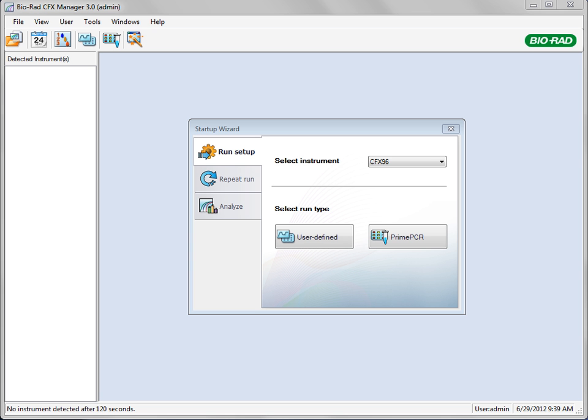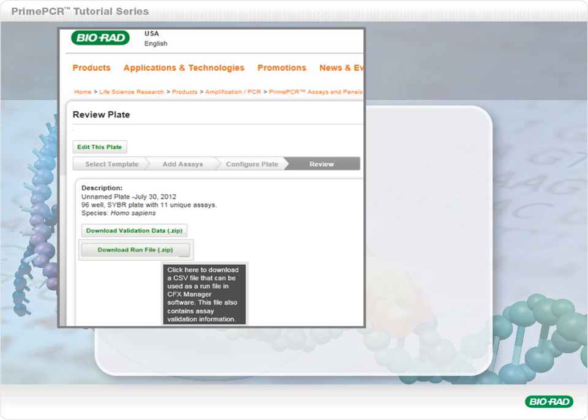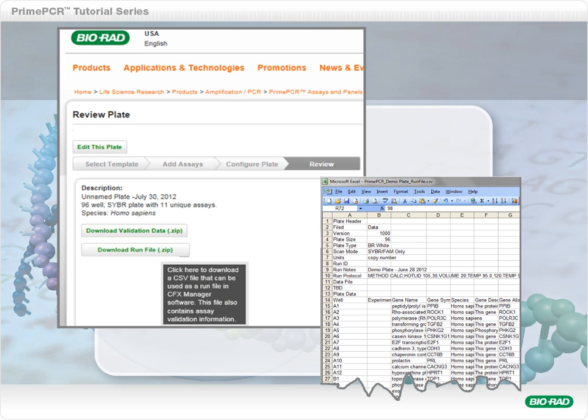To facilitate gene expression analysis, a PrimePCR run file can be imported into CFX Manager software before, during, or after a run is complete. The run file contains the name and location of each target on your plate. By importing this file, you do not have to input this information manually and can quickly begin gene expression analysis once your run is complete. From the PrimePCR website, download the PrimePCR run file that is specific for your plate that you are about to run.